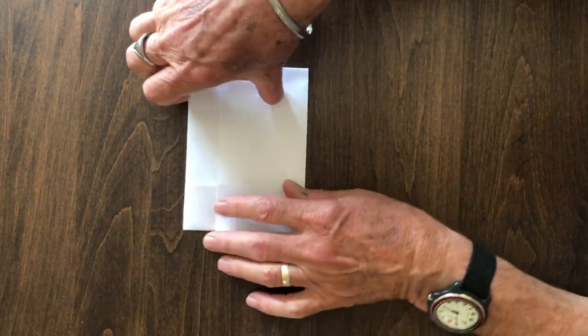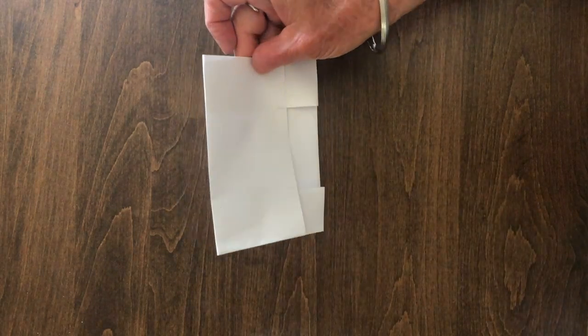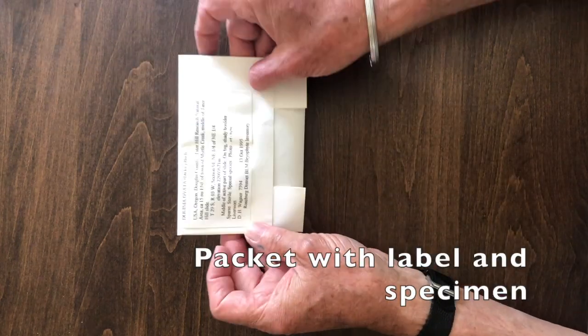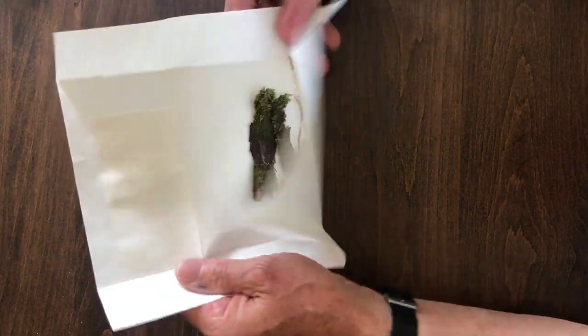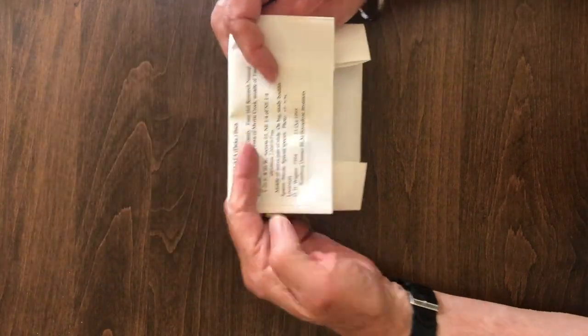Then fold up the top of the packet where the label goes, and that's a complete packet. You can either print your label on top of the packet or type up the label and glue it on. This way you know which way is up, it's easy to open, and there's the specimen in a cryptogam packet ready for insertion into the herbarium.